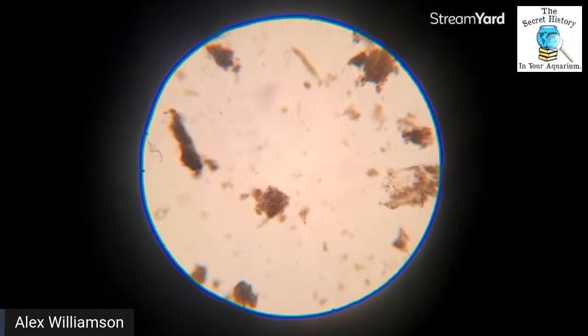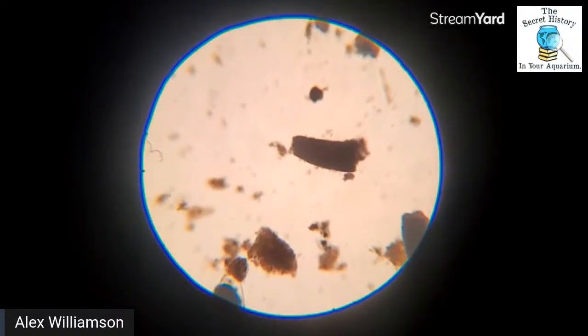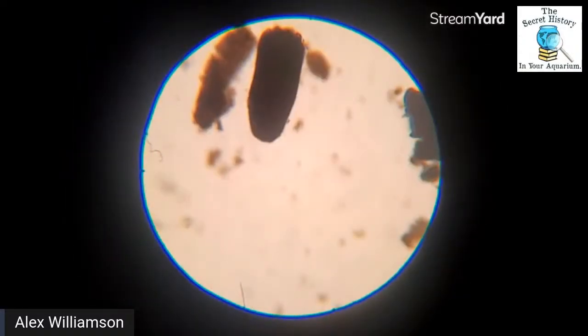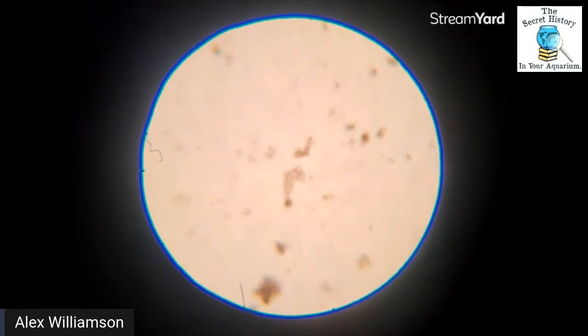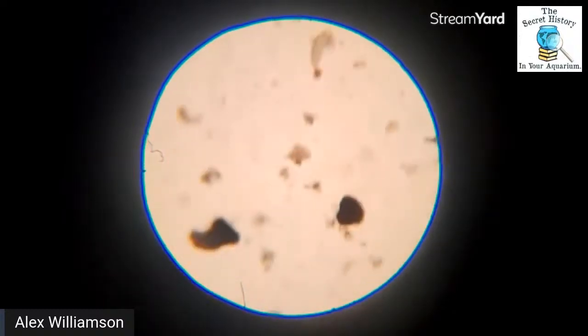I have to move it slightly. Let's see. Hey, maybe we'll discover a new life form, everybody. You guys can name it. So we have another little life form right here. I can't remember the name of their group, but it's one of those foot life forms. It just holds on, and it's already held on to the glass. It's going to hold on there and then pull itself along like an inchworm, very slowly. But they're not very interesting to watch unless you have a time lapse.